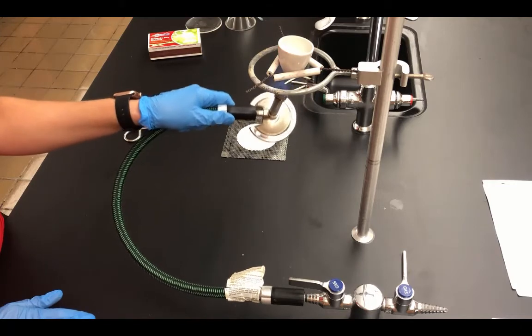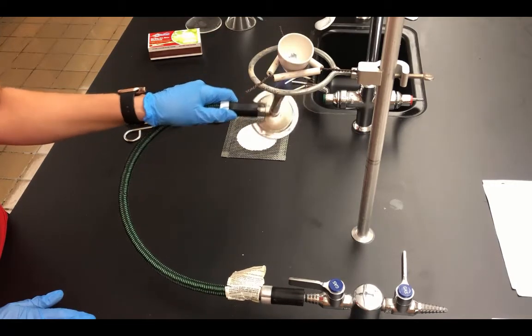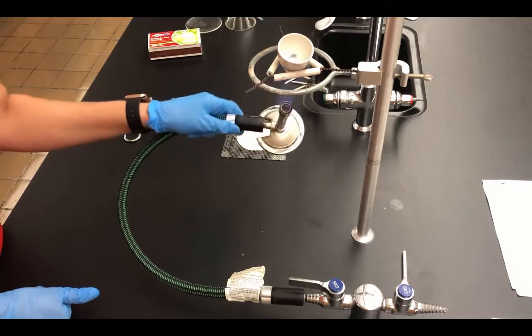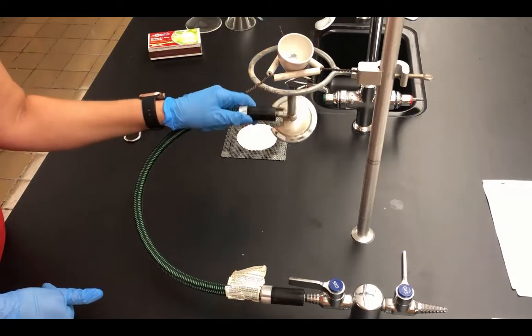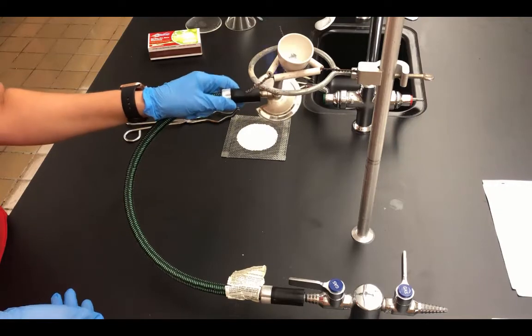But the reason that we want to make sure to continue to heat is so that any water is gone. And there are other labs, like determination of a hydrate, where you can actually figure out that coefficient in front of the H2O by doing something similar to this.